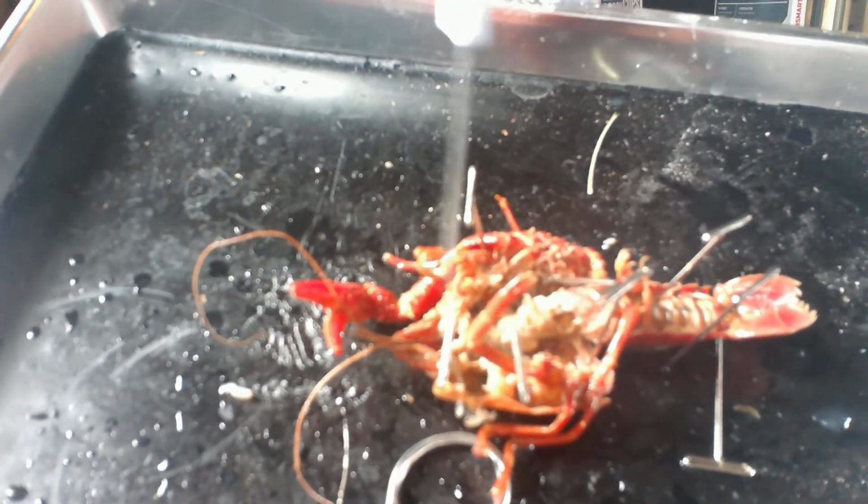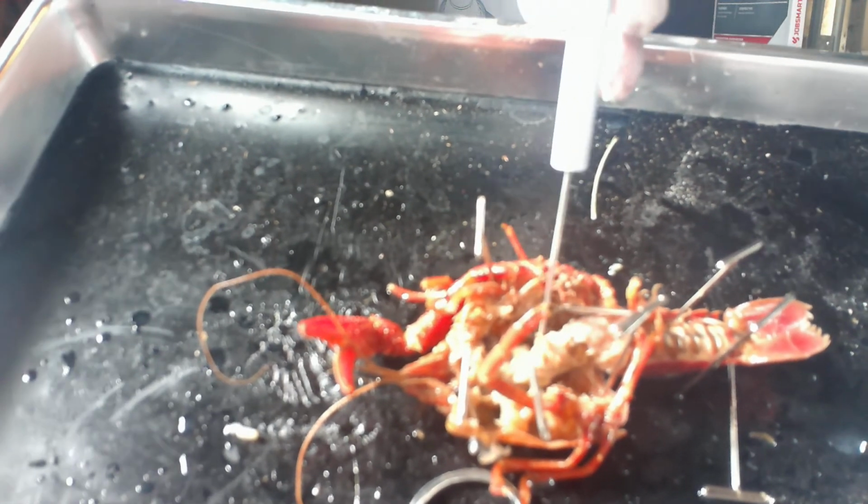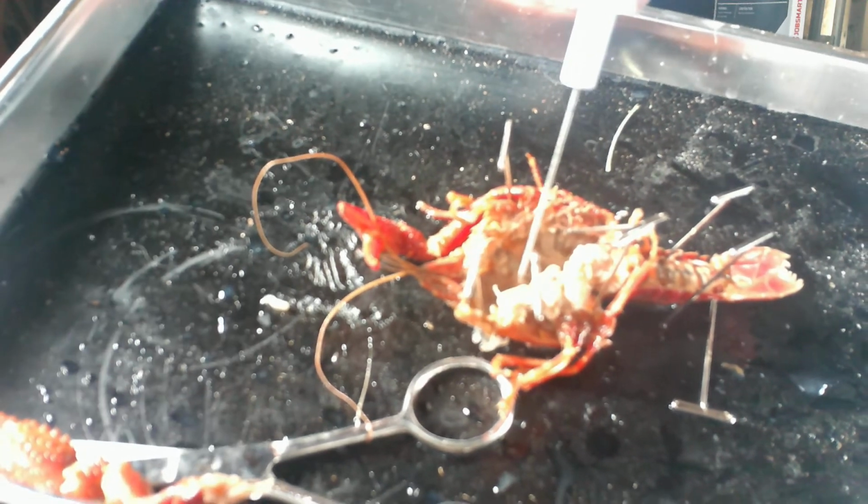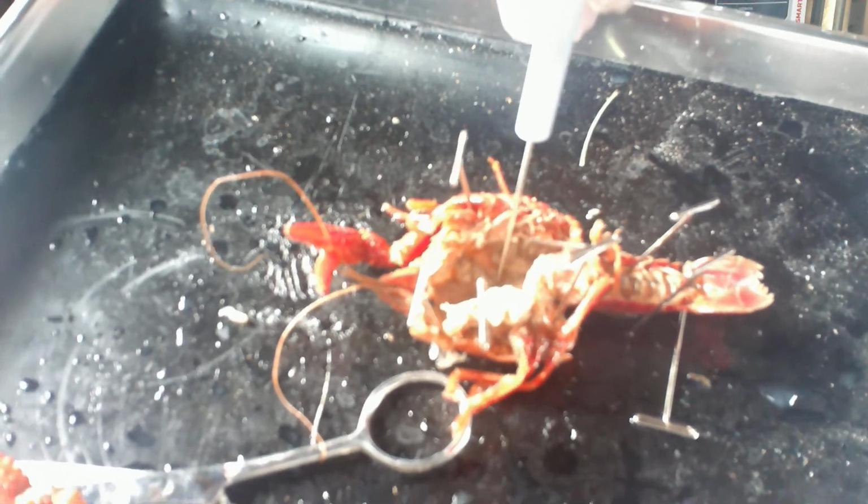Coming up this way, you can't really see it very well, but there's a little antenna artery that serves for blood flow up this way. And then all the way at the back here, there we go. So if we turn this guy all the way over, right back here, that's actually the heart.